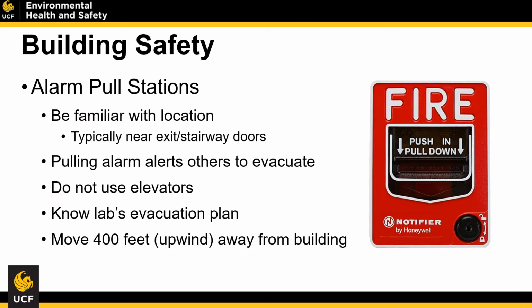In the event of an emergency or fire, and you do have to evacuate the space, please make sure that you activate one of the pull stations to indicate that the alarm is sounding. We want to make sure that everyone is informed that there is a fire or an evacuation, and these pull stations will do that. A visible and auditory alarm will sound throughout the building, indicating that all personnel should leave.